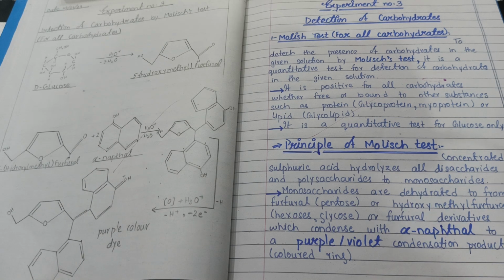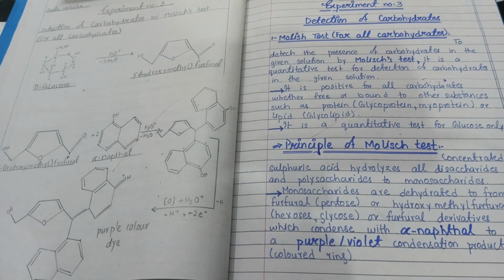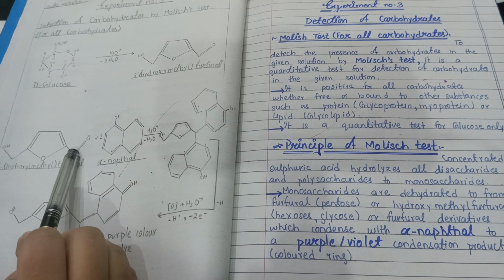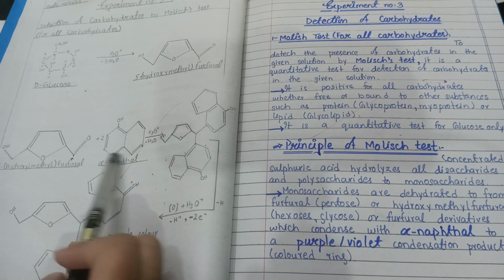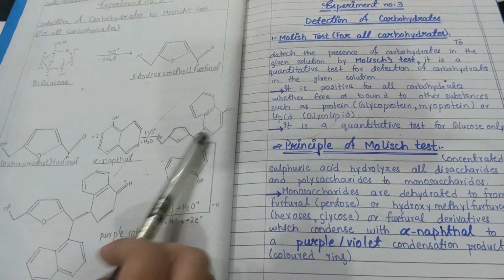Okay, and if a solution has some kind of carbohydrates in it, then it will definitely show purple color to you. So how to remember this structure? This is very simple, just focus on it. First you have to take this bond, remove this double bond and oxygen atom. From this oxygen atom you are going to attach this alpha naphthol structure, as it is indicated.